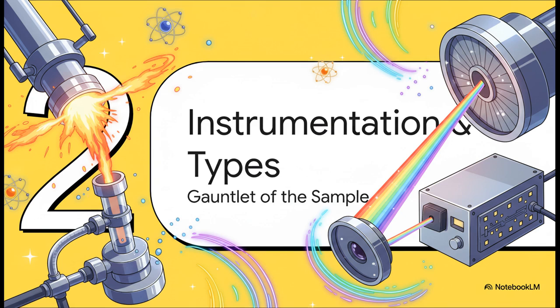Section 2. Instrumentation and AES types. The gauntlet of the sample. Let's step into the lab and see the actual hardware our sample has to survive.